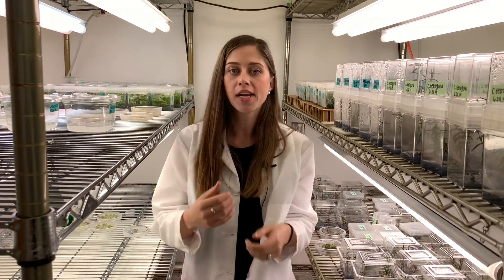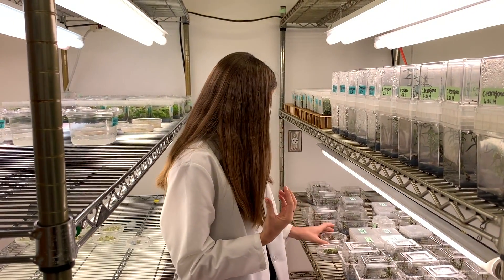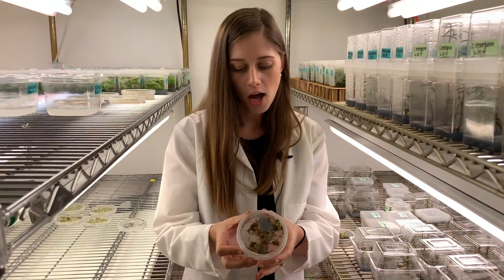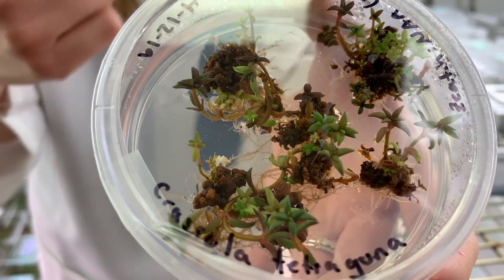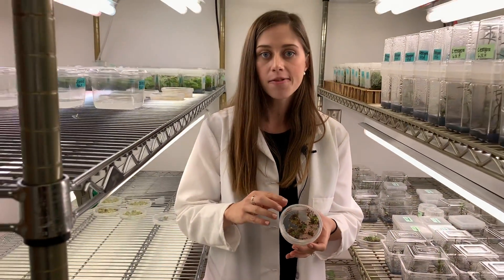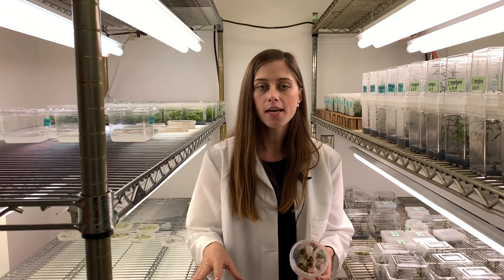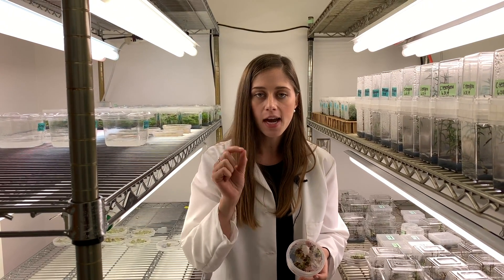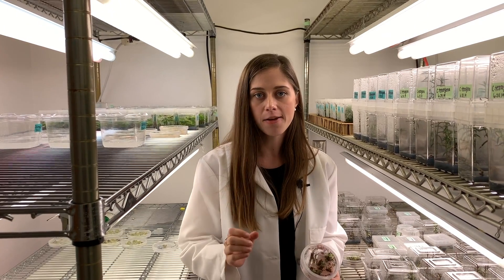Next, we switch to another medium that promotes shoots to grow. On here we see the brown callus and the shoots that are now growing up out of it. This is so cool because instead of growing plants from a seed like we normally do, we can make a clone of a plant by cutting up a tiny piece of its leaf and mimicking different developmental stages.